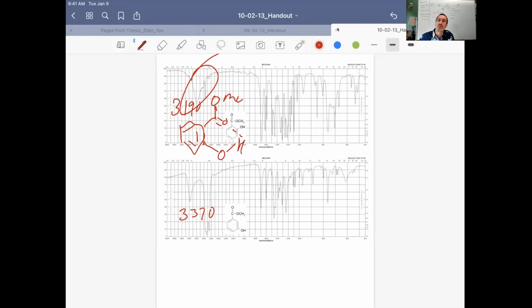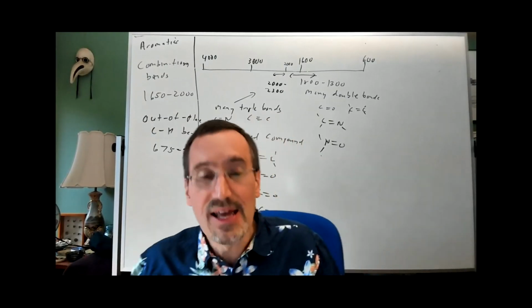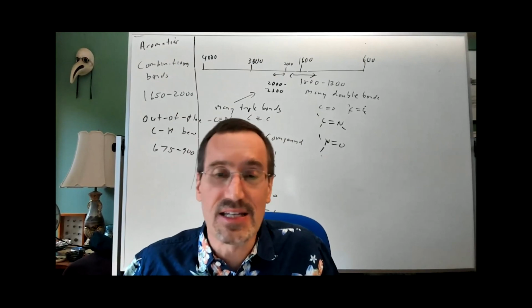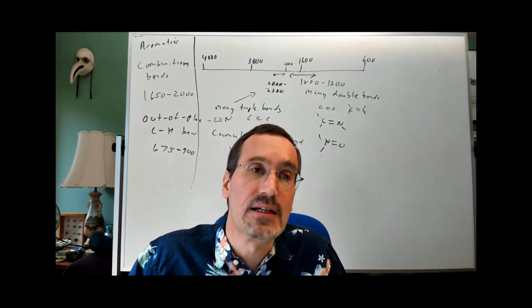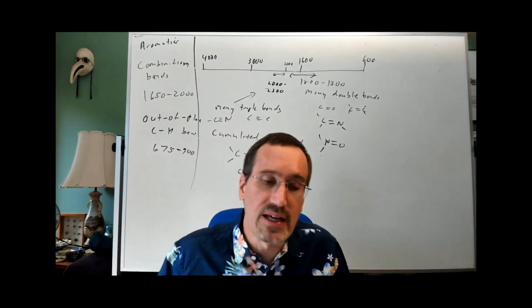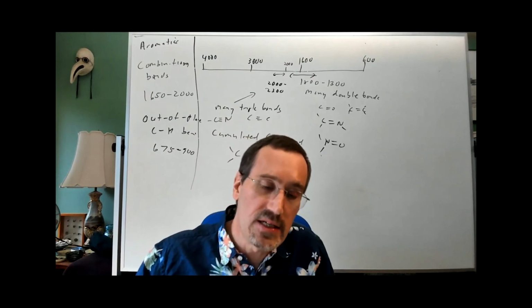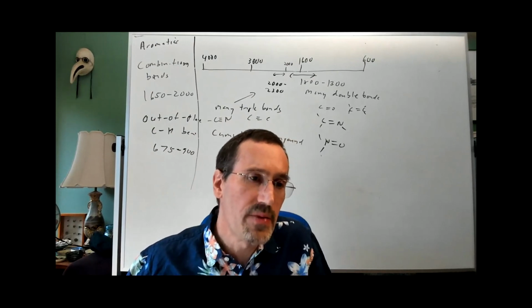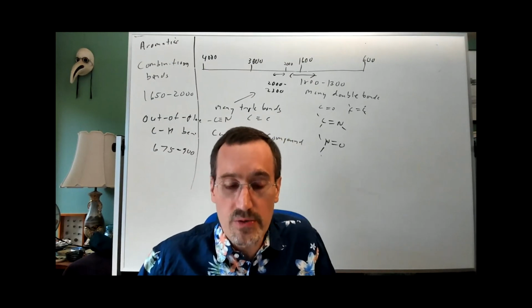And I think one of the problems you have is 2-pentene. And so you might look at that and ask, is it cis-2-pentene or trans-2-pentene, or it may be octene. Anyway, take a look. It's fun to be able to go deeper than you need to go in IR spectroscopy, even if you've just seen it once. And I urge you to do that.